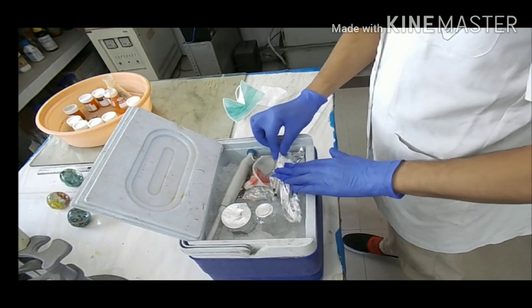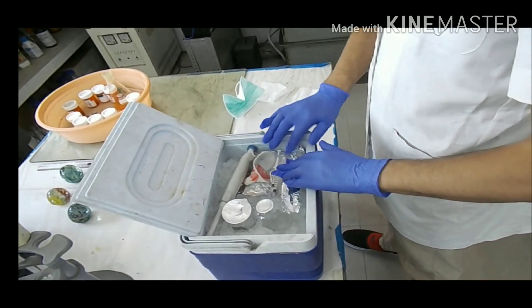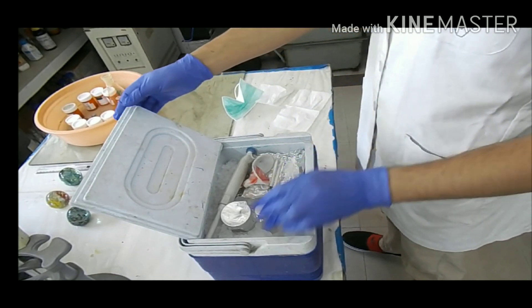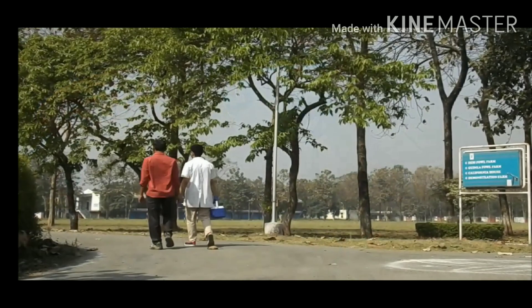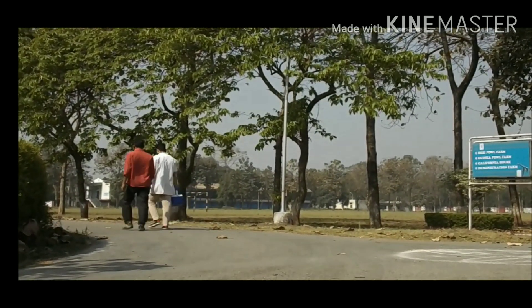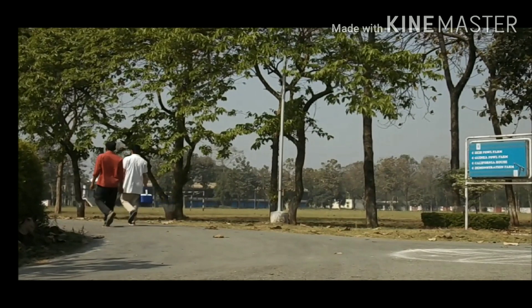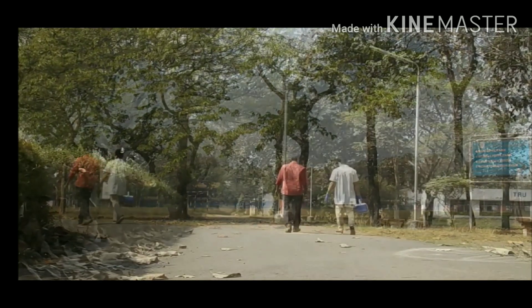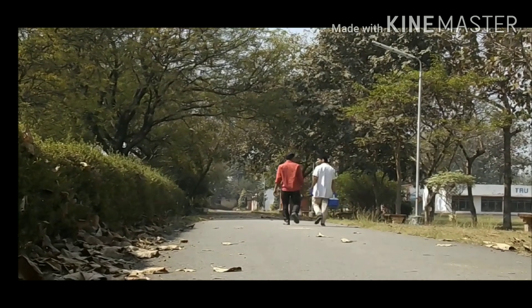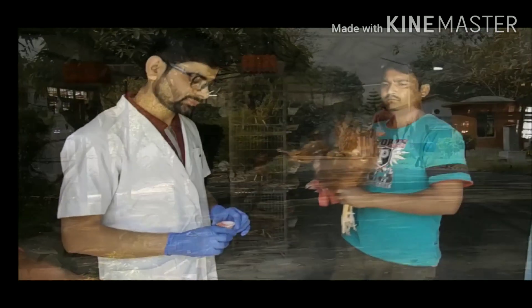Tissue papers are required to clean the area from which we collect the semen. All these are placed inside an ice box to keep them cool. Now we are heading towards the poultry shed where we have breeder stock. Dr. Mukesh is with me.